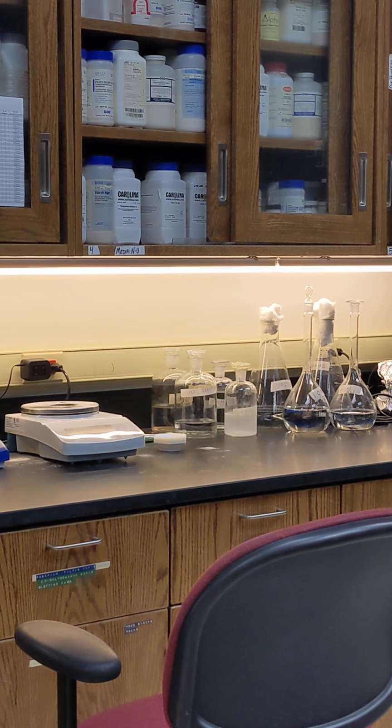The reason I'm going to do that is I happen to be short on plates, and that allows me also to do a demo. In your lab manual, it tells you how to make the broths, the slants, the deeps. So I'll tell you a little bit about those as well as we work through.